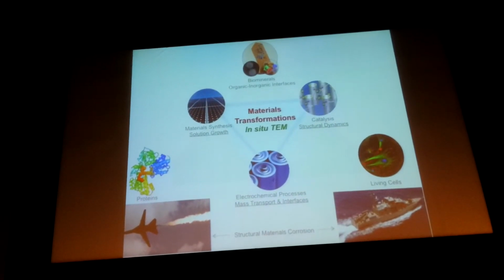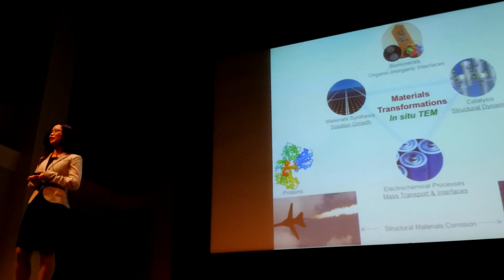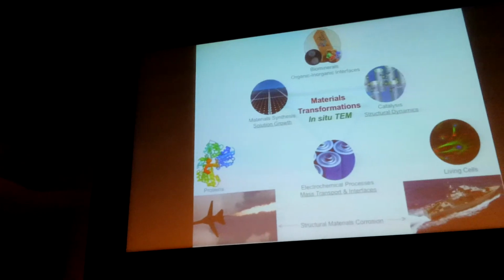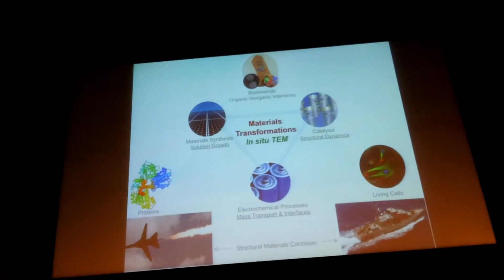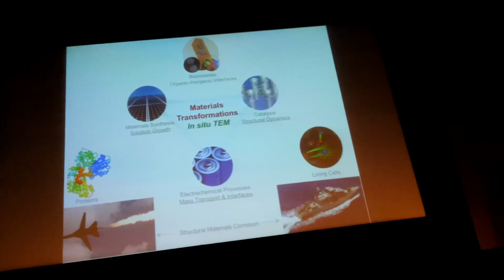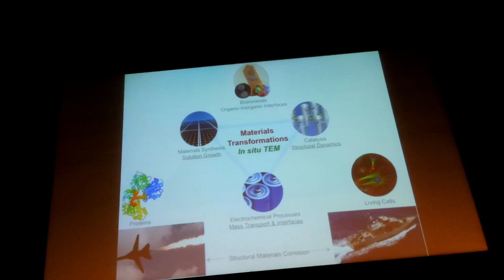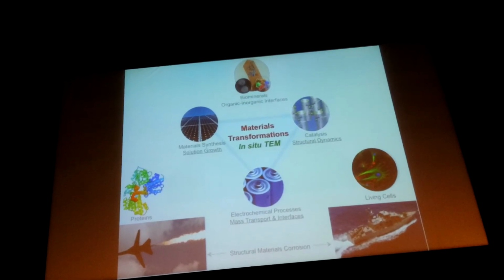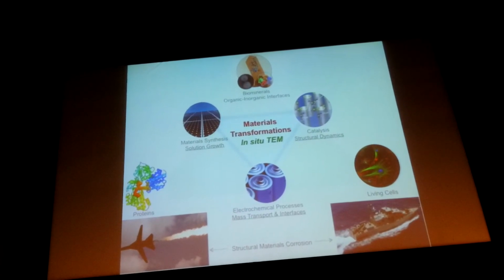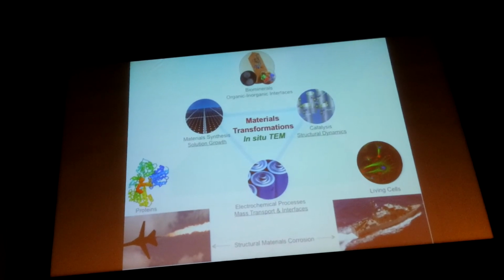In summary, using liquid cells, we no longer have to guess how materials transform. We can directly observe material transformations using a transmission electron microscope. This is going to advance our understanding of materials and help us to solve world important problems.